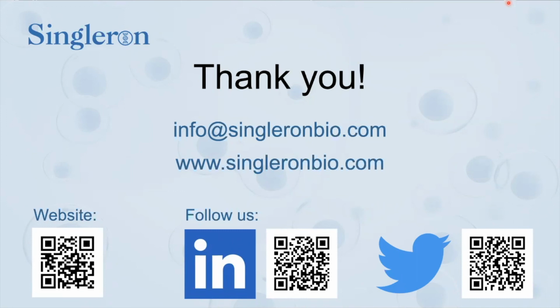The first one is how to choose the right technique for the experiment. It all comes down to the research question that you're interested in. For example, in the beginning, I introduced you to high throughput and low throughput systems. And the main difference is the gene coverage that they offer. So let's say the cell type that you're interested in is not a rare cell type, you don't need to sequence too many cells.